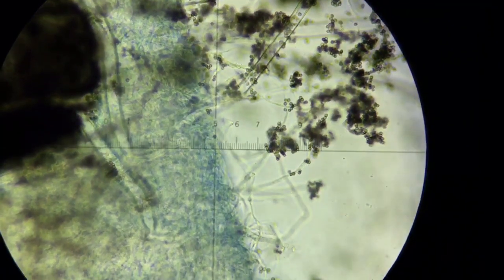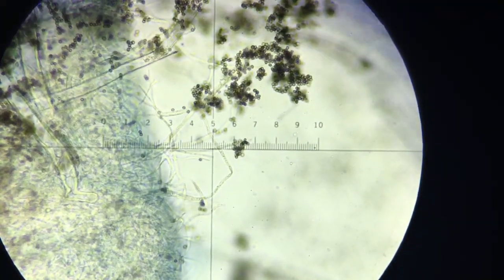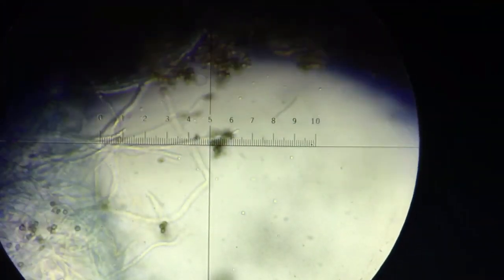So now let's go to 40x and look at some of the other structures. I had a hard time getting a good example of septation, but this is the other really important thing that distinguishes the zygomycetes from the other fungi.